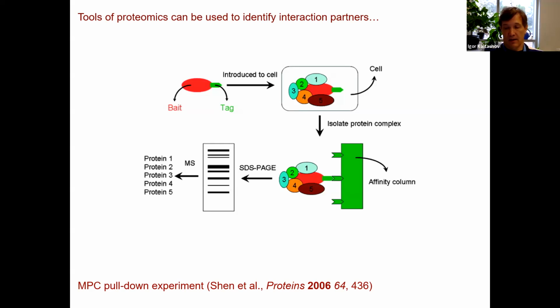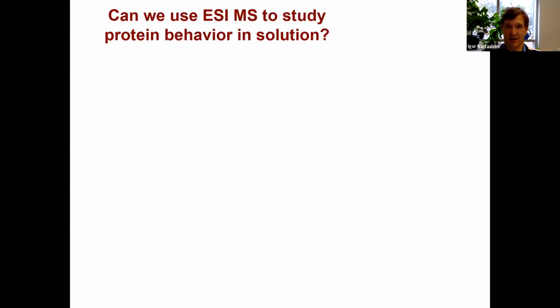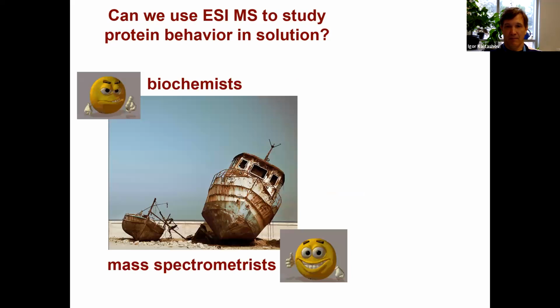And so before I begin this discussion, I want to show my next slide. And the reason I want to show it is that very frequently mass spectrometrists are criticized by the physical community for attempting to characterize high order structure of biopolymers in the gas phase. And so the argument is that once you remove your biopolymer from its native environment, which is aqueous environment for the most part, right?